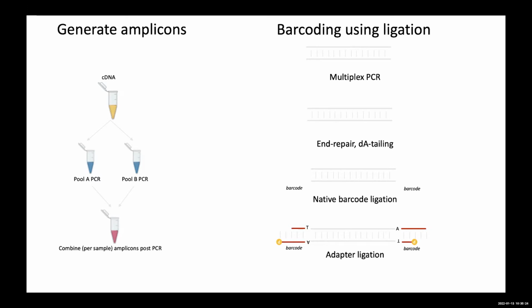So you've got two stages of multiplexing here. You've got multiplexing going on in the PCR, and you've got multiplexing going on at the sample level, and that gives you thousands of amplicons in the same sequencing library. And really the challenge of designing a good sample prep for viral genome sequencing is this ability to multiplex at both the target and the sample level in the simplest possible way. And that's actually quite challenging, and that's one of the things that I work on all the time.